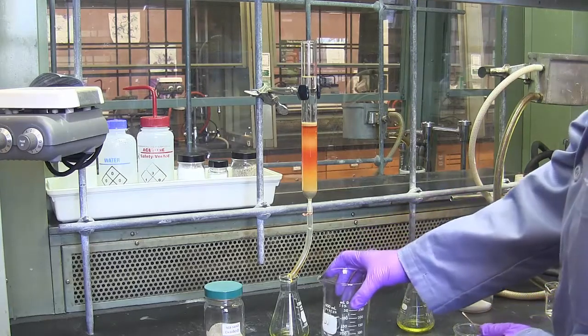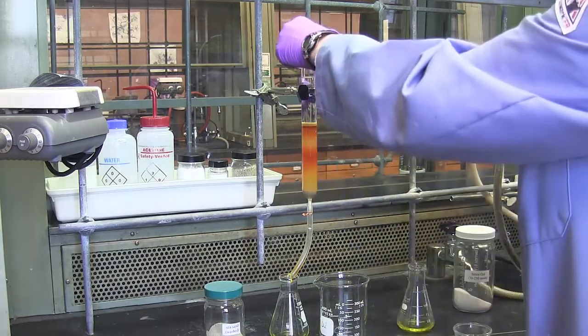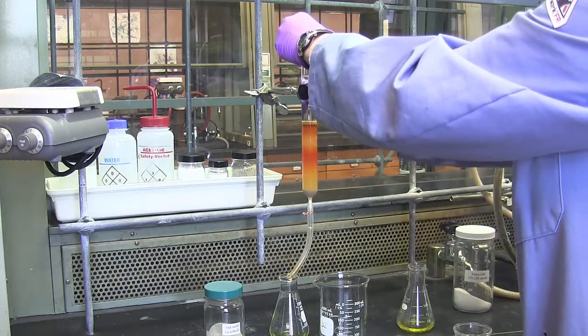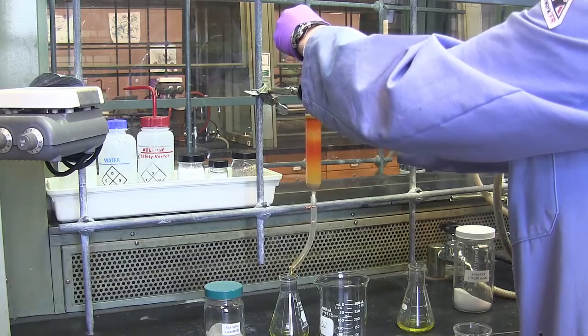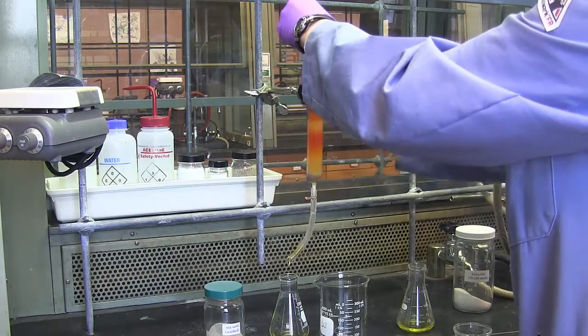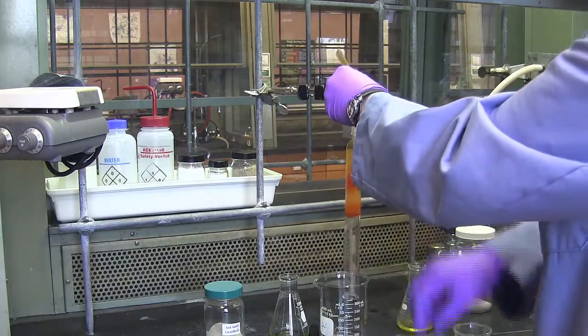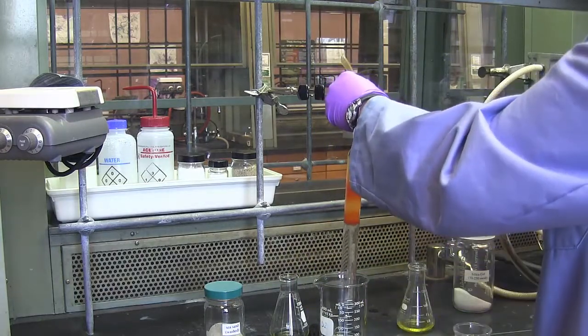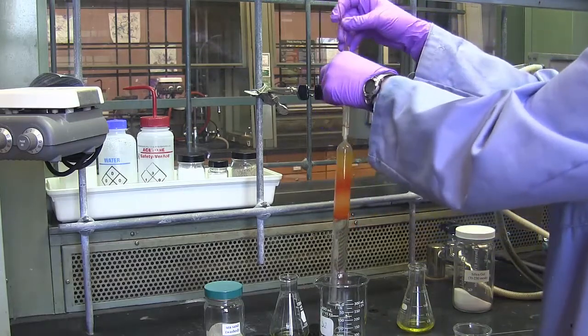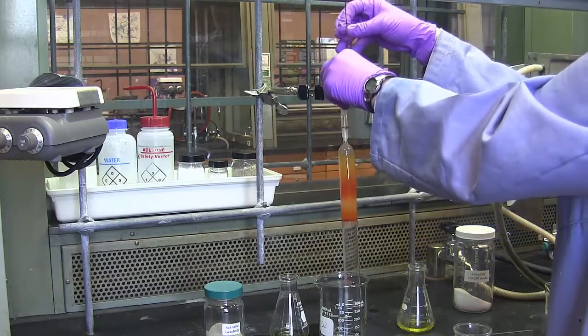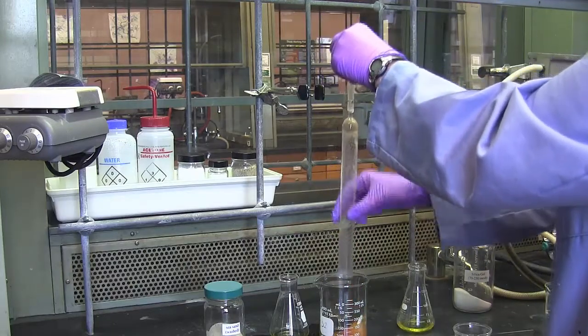When you have collected all the fractions that you wish to collect, it's very easy to clean out the column. Get a large beaker from your hood. Turn the column upside down into the beaker. Use a piece of copper wire to remove the cotton plug. As soon as you do, all the contents of the column come pouring out.